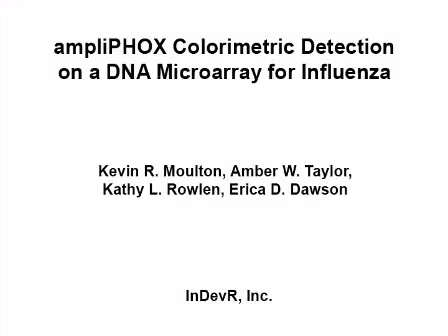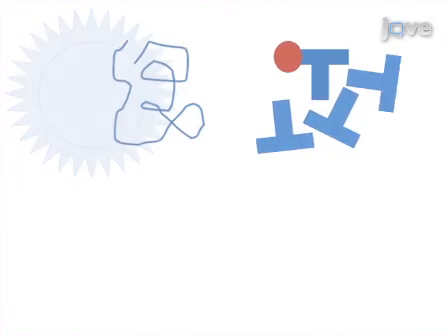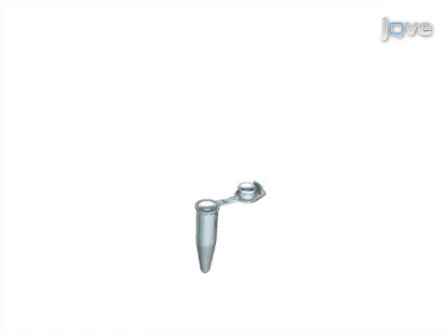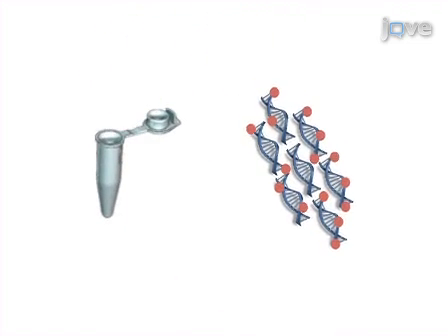The overall goal of the following experiment is to utilize a new and rapid signal amplification method to detect and characterize influenza viral subtypes on the flu-chip low-density microarray platform. This is achieved by incorporating biotinylated dNTPs and using primers with a 5' phosphoryl end to amplify the matrix gene segment and a non-structural gene segment from influenza RNA extracts.